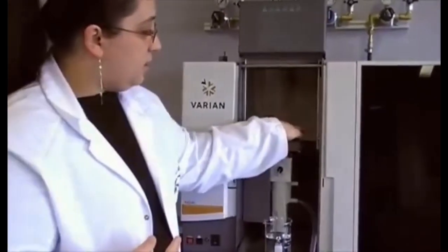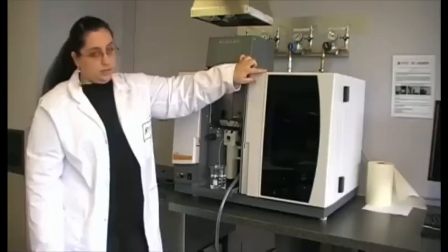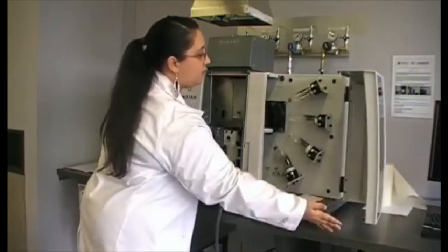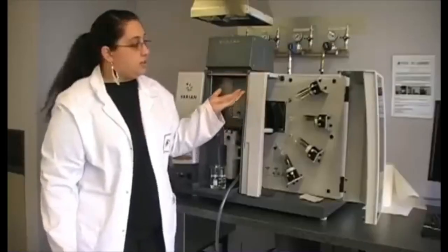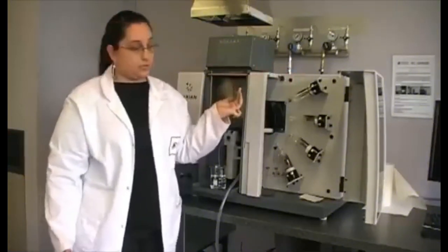At this point, a light is shone through the base of the flame, and this is where we can get excitation of electrons that are within the atom or ion that we're interested in looking at. And this light comes from a hollow cathode lamp. Over here in this section of the instrument, we have a range of hollow cathode lamps. Now in your textbooks you might have seen some instruments and they just have one hollow cathode lamp. The lamp is specific for different elements. So for instance, this top lamp we use for calcium, magnesium or aluminium metals.